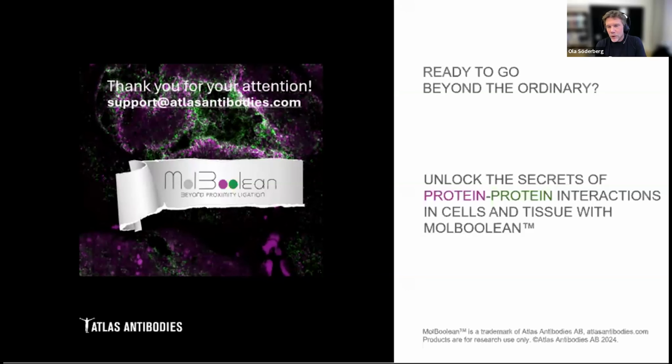So it would be possible to have protein A, B interacting with C, D, and then you see all the different combinations. But that is not something we have tried yet. I think in theory it should work fine. We have done similar things with PLA, so I don't see why it shouldn't, but it will require some oligonucleotide design.